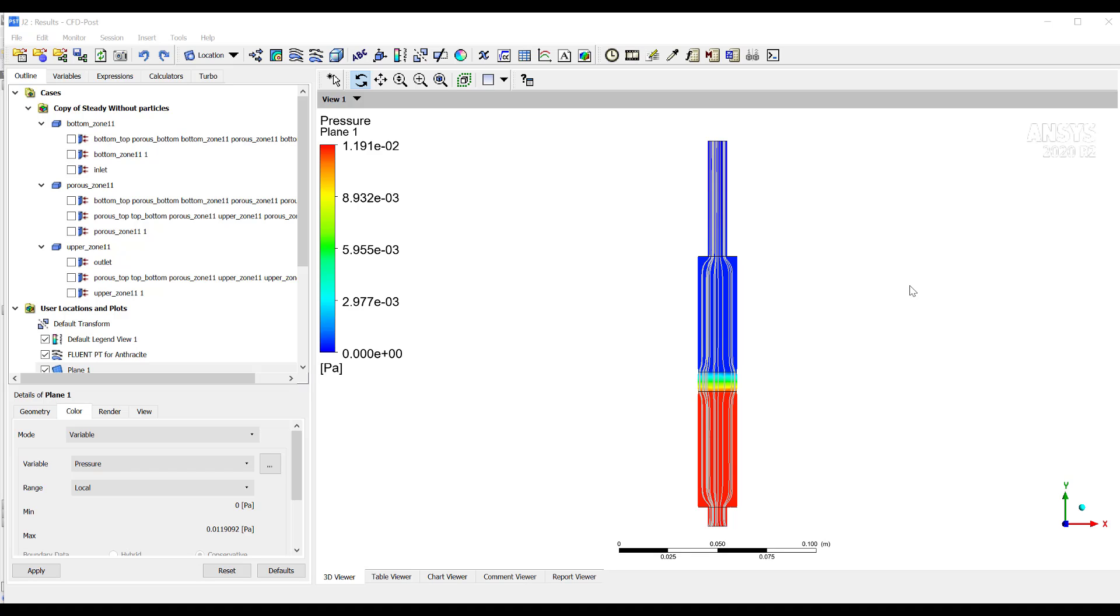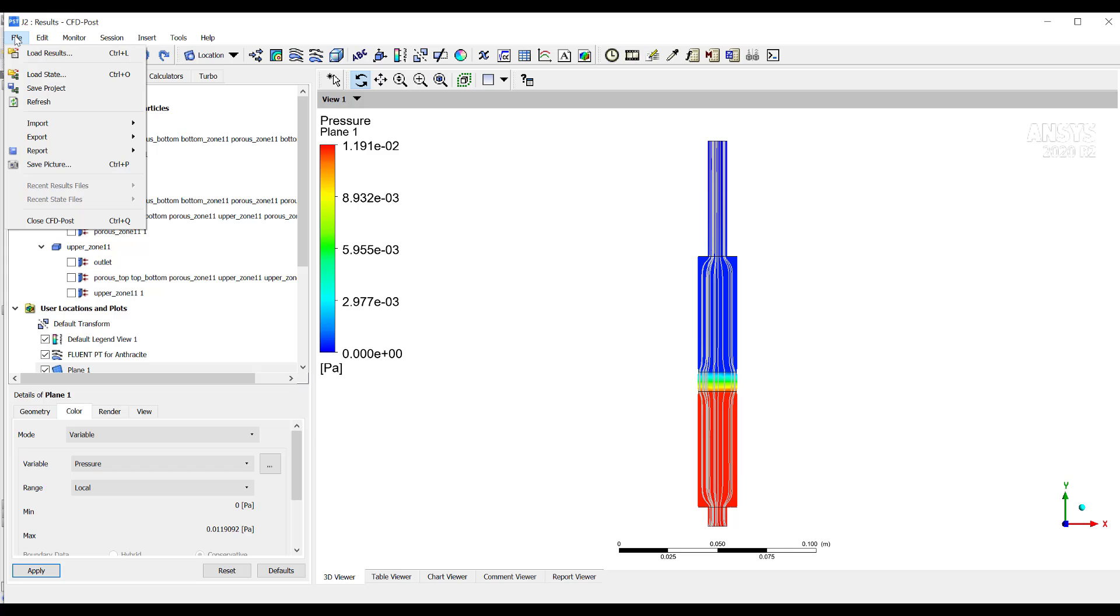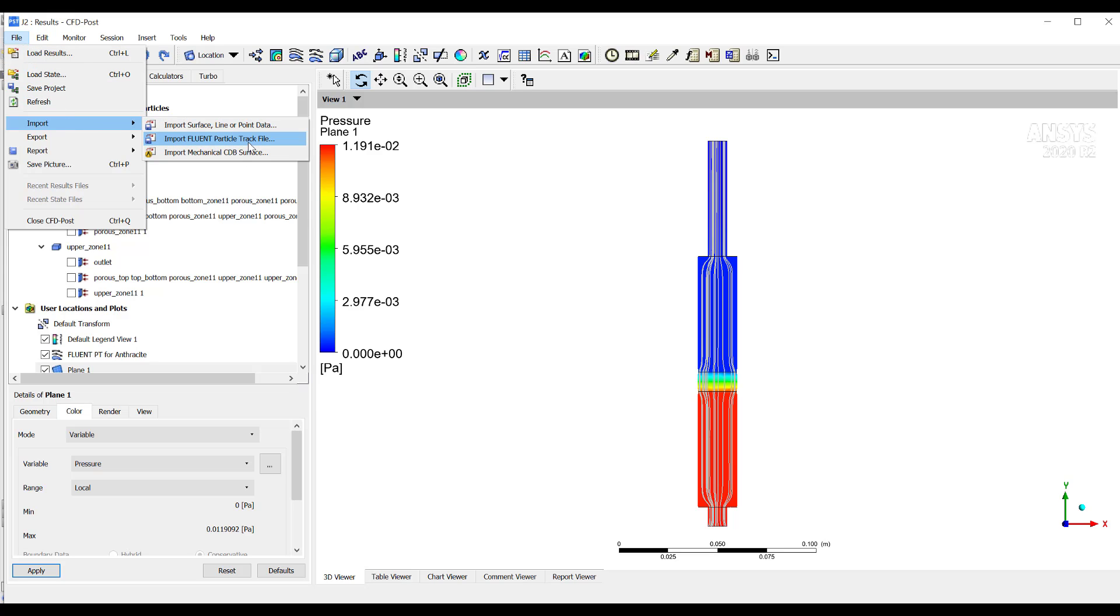If you want to see how this case is characterized, then you can go to CFD Post and you can import the particle data. Remember that for doing this in CFD Post, you need to export the particle tracking data from Fluent and import it here in CFD Post. For doing that, then you go here to import and import particle track file. Remember this particle track file must be exported from Fluent.